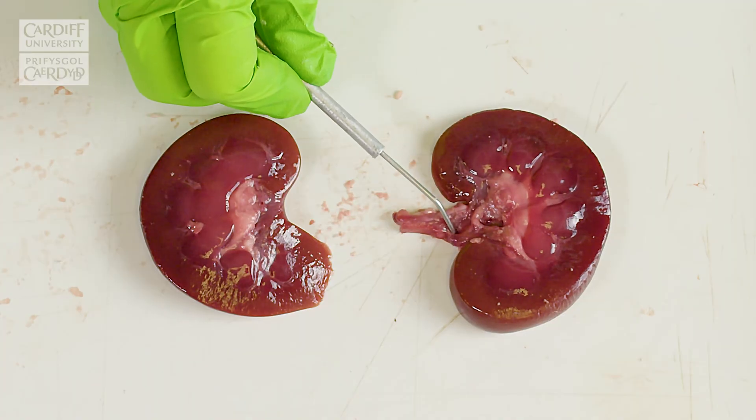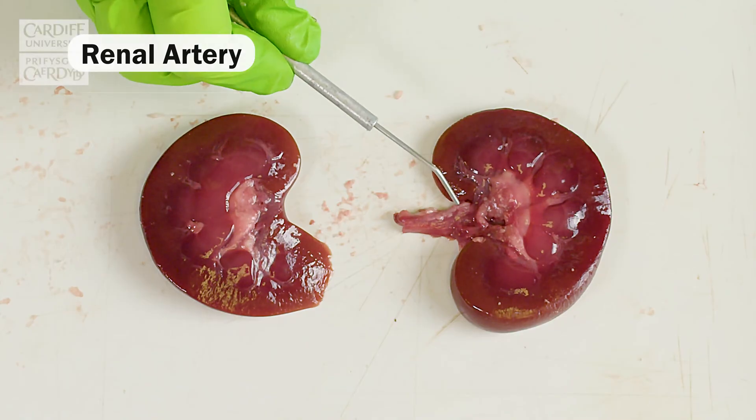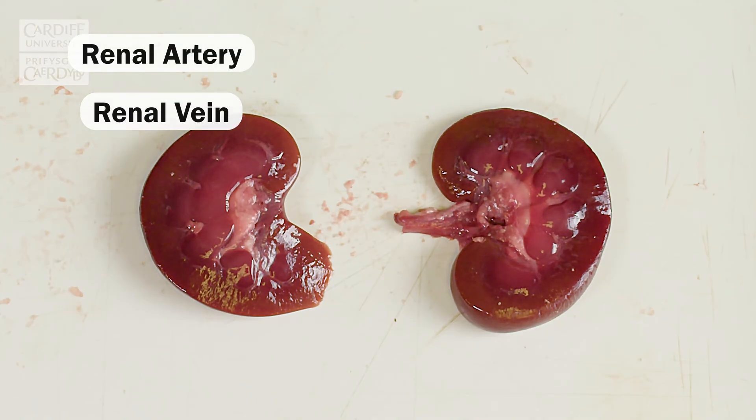In a similar location, we have the renal artery, which brings blood into the kidney, and the renal vein, which removes the blood from the kidney.